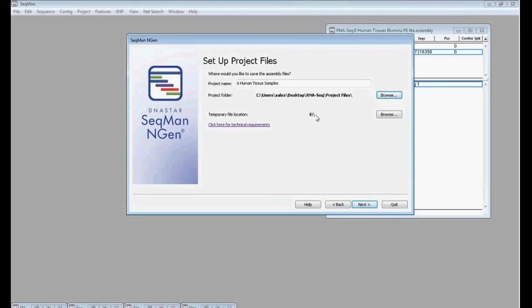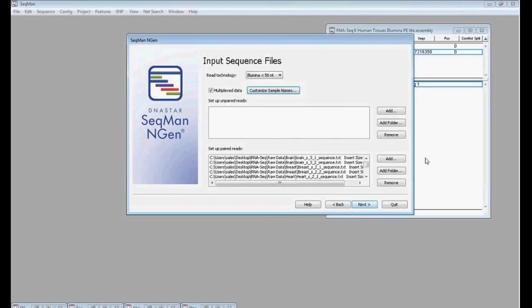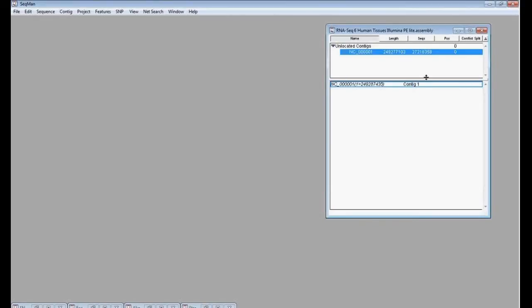The files in this location are used during the alignment of your data, and they do remain after the alignment. You can delete them if you want. However, if you anticipate rerunning your alignment, you can leave that in there, and the alignment speed will increase significantly. But if you don't have the need to rerun your alignment multiple times, then you can definitely delete those files. It's just temporary space. Great. Okay, thank you. All right, we'll move back into SeqMan if there are no additional questions.